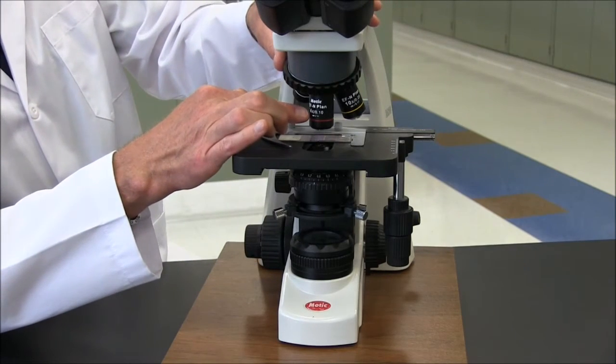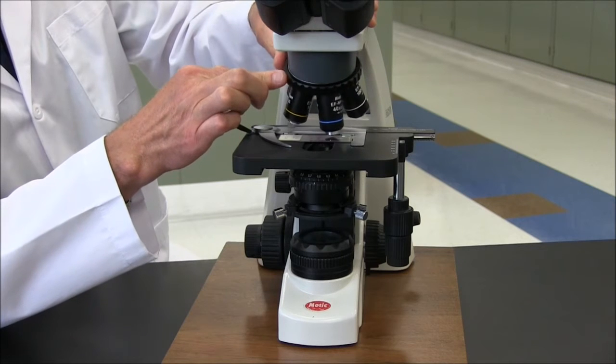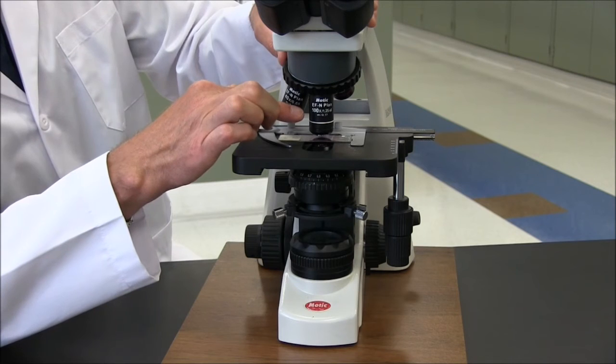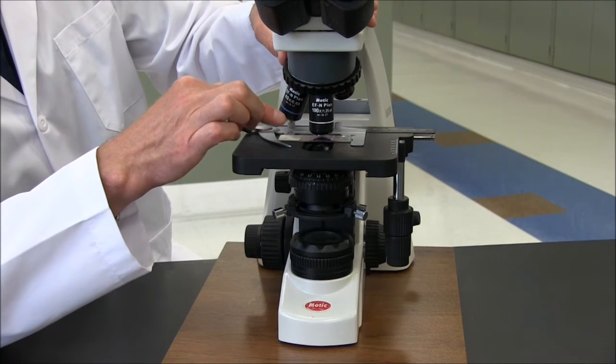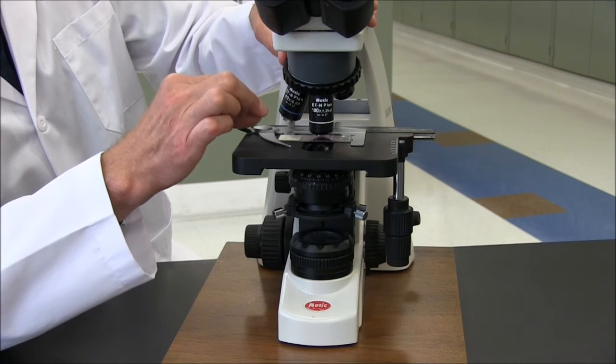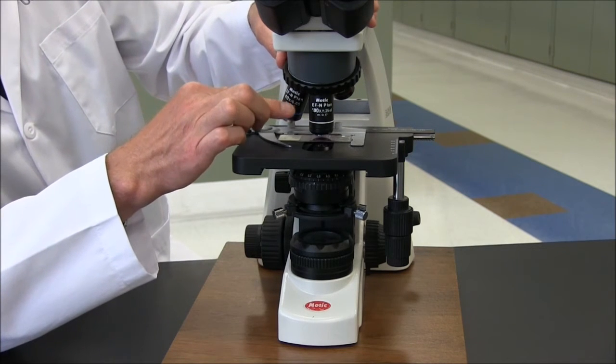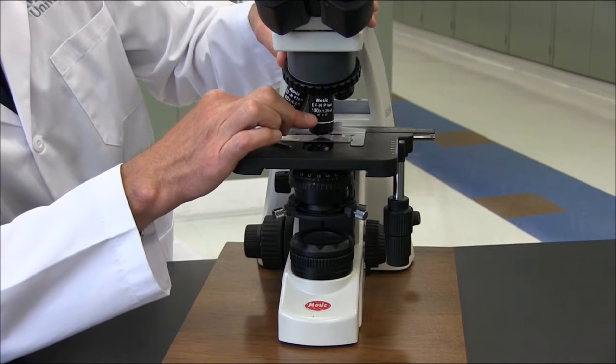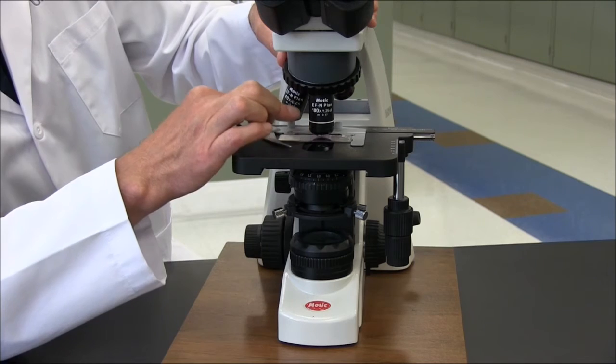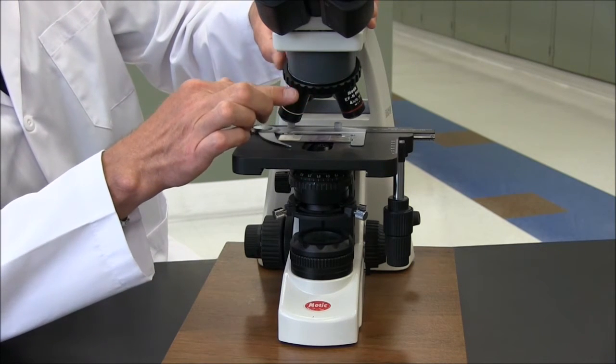These are the objectives. In this microscope, there's a 4x, 10x, 40x, and a 100x objective. This is an oil objective because the focal distance between the slide and the objective is so small, you'll need a thin layer of oil in order to see it properly. You can always tell an oil objective because it will either say oil right on it, or it will have a black line that you can see here indicating that you need oil. There's also space for one more objective in here.